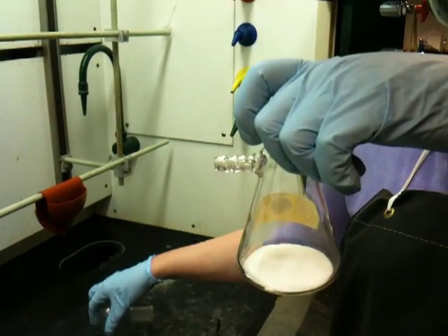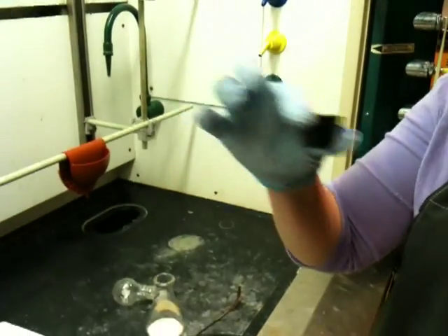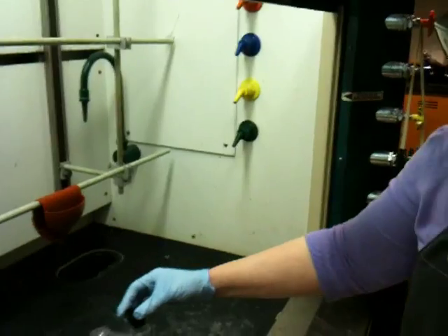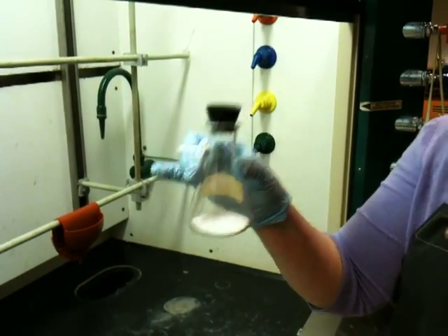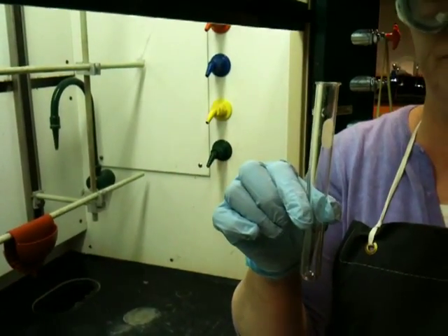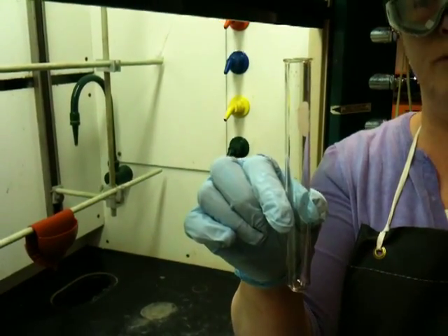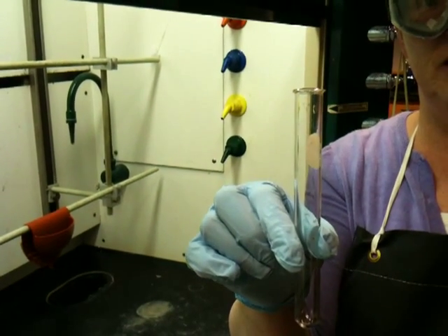The next part of your procedure will involve getting a rubber adapter like this one, placing the rubber adapter in your 125 milliliter suction flask. Then you will get a test tube — this is just a run-of-the-mill test tube from your kit.